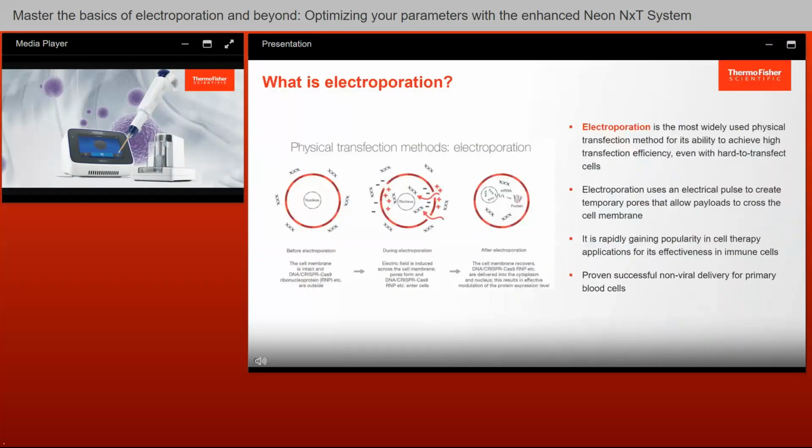There are several advantages of electroporation over lipid-based transfection. These typically include higher efficiency and versatility to transfect some hard-to-transfect cell types, such as primary cells and stem cells, for various downstream applications. Additionally, electroporation is generally a quicker process than lipid-based transfection and requires no lipid-based transfection reagents.